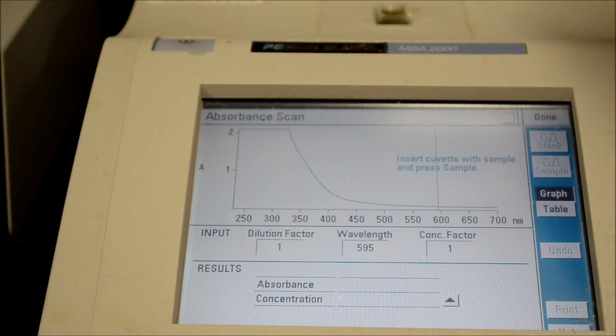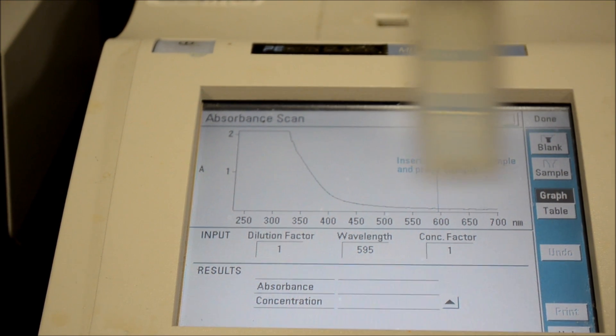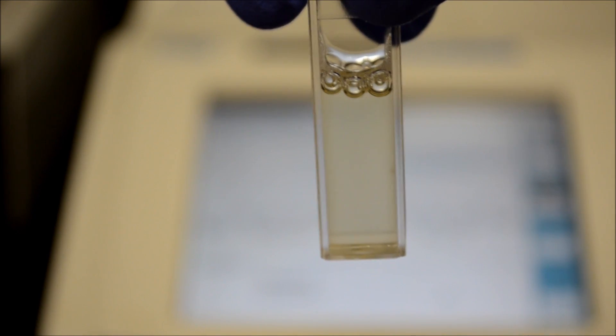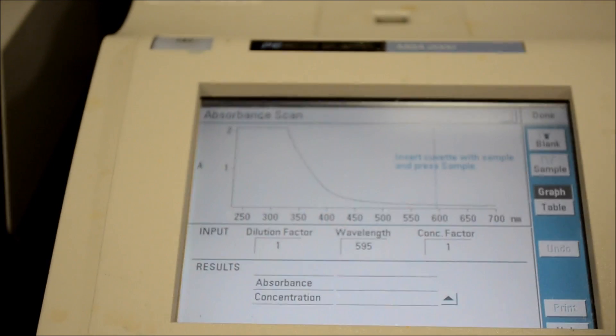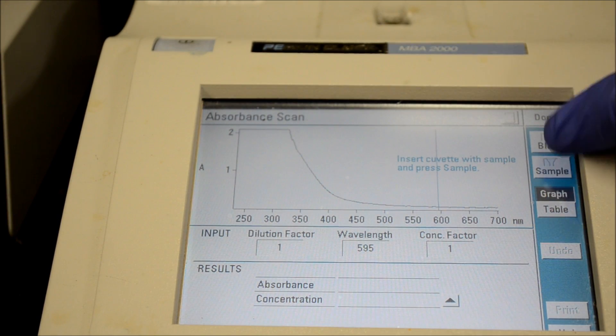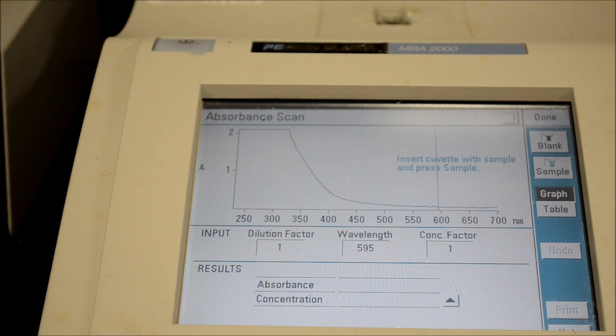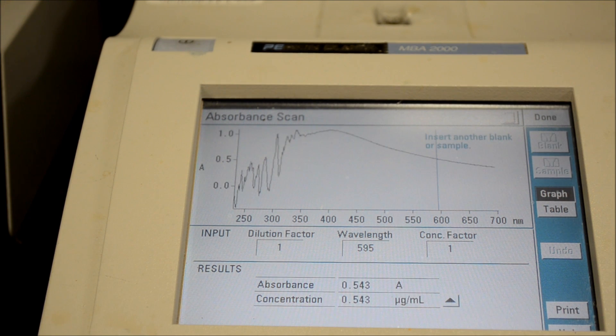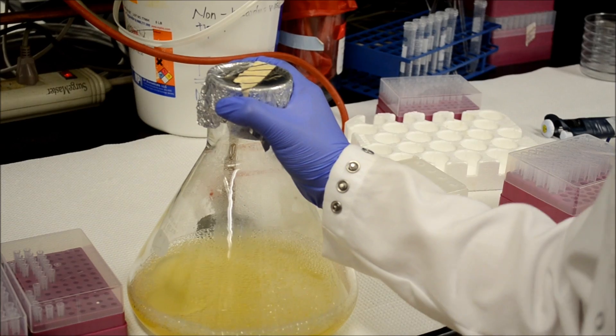After it's read the baseline, take out the blank and now place the sample in the cuvette with the bacterial culture. You can see here that it is cloudier than the blank, meaning that your bacteria has indeed grown. Now press sample and wait for the machine to read the sample. You can see here that the absorbance is 0.5, which is perfect for what we need.